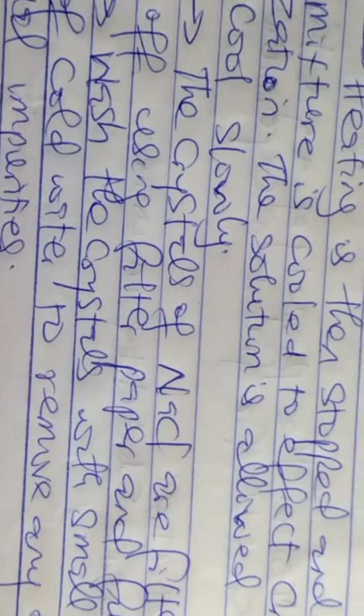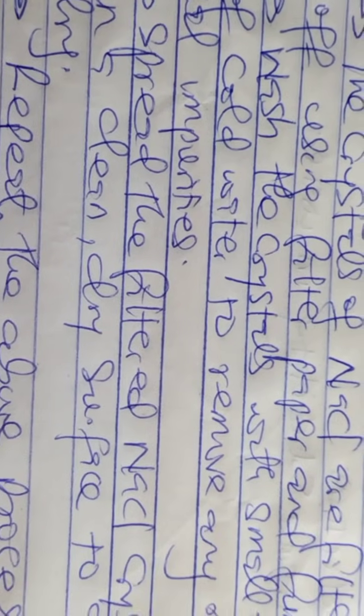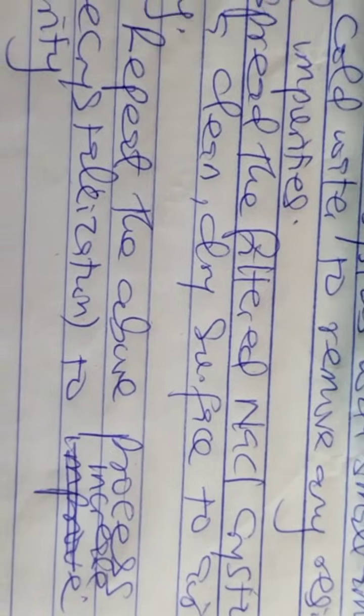The next step, the crystals of sodium chloride are filtered off using filter paper and funnel. The next, wash the crystals with a small amount of cold water to remove any residual impurities. The next, spread the filtered sodium chloride crystals on a clean, dry surface to air dry. Then finally, repeat the above process, that is recrystallization, to increase purity. So go to the next question.